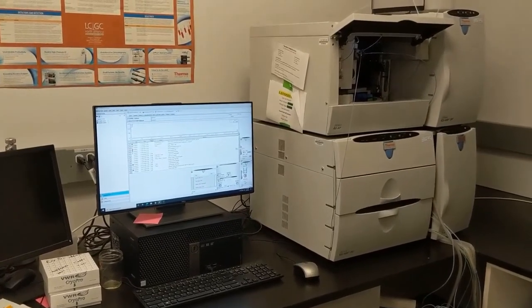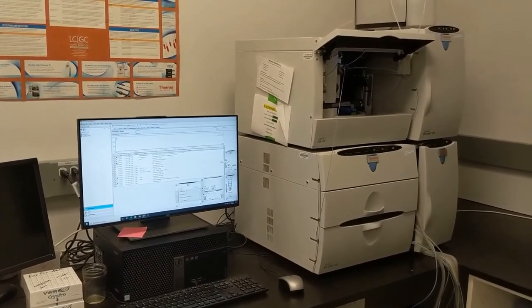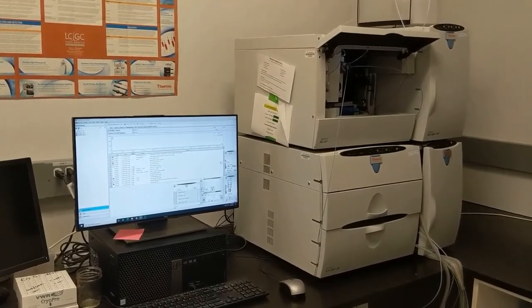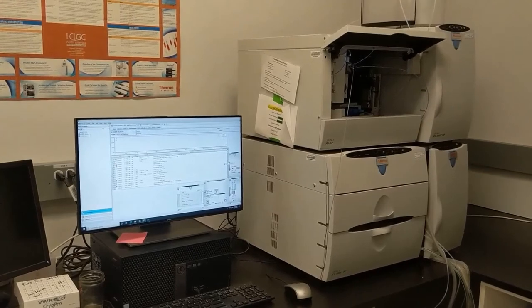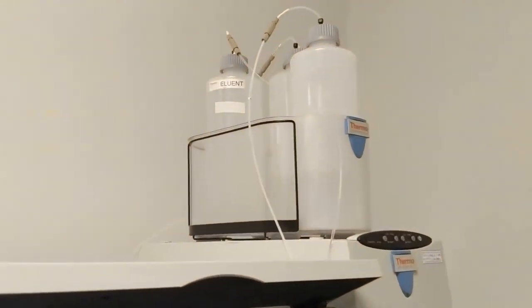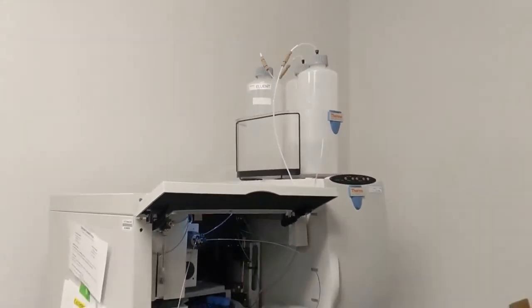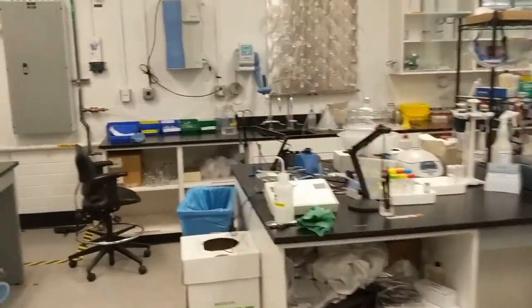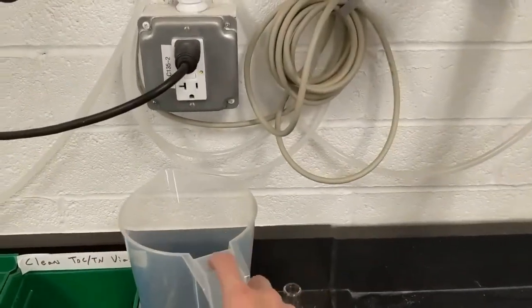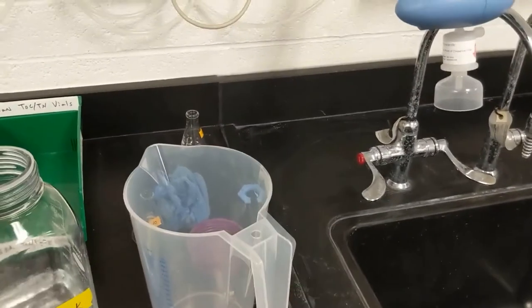Now we have to get the IC ready to run. The IC is going to take a little while to equilibrate, so we want to get this all set up before we start creating our run program. The number one thing you need to pay attention to before running is those bottles of water up there. They've been running for a while and are almost empty — these need to be filled with nano-pure water.